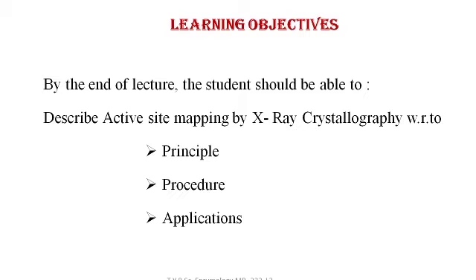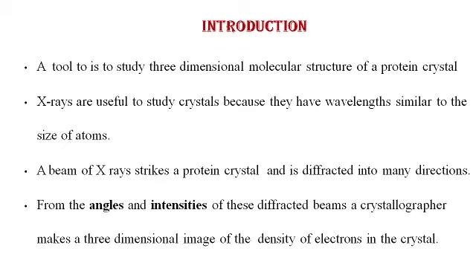The learning objectives of this particular lecture can be defined as: the student, by the end of the lecture, should be able to describe the active site mapping with X-ray crystallography with respect to the principle, procedure, and applications of this particular method.